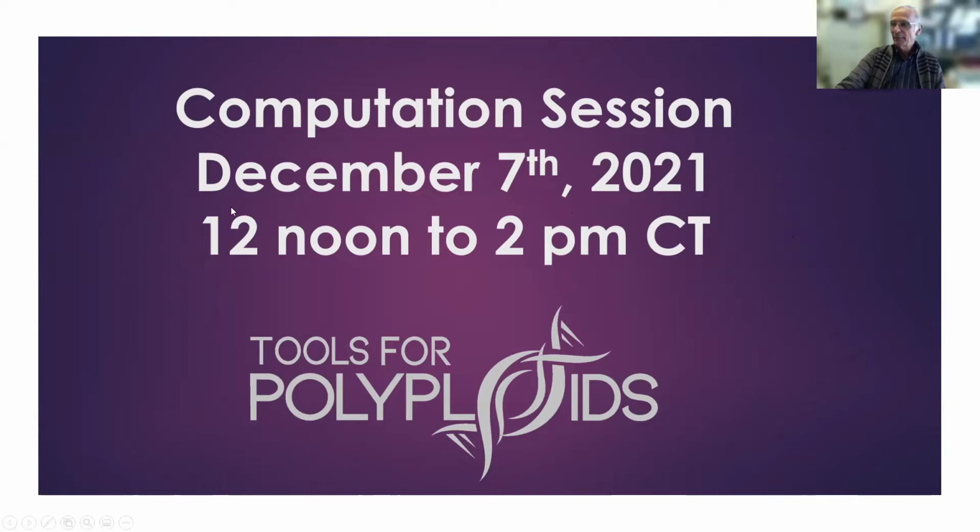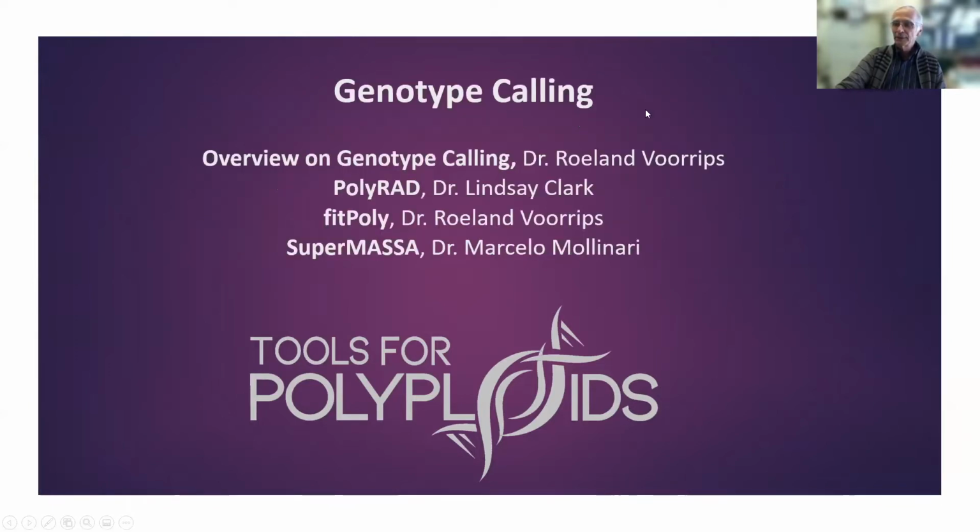Welcome everybody for coming. This is the Tools for Polyploids project. This is a computational session, the first one; there'll be two others. This first one, we want to do two things. One is for those who are not familiar with the genotype calling software.